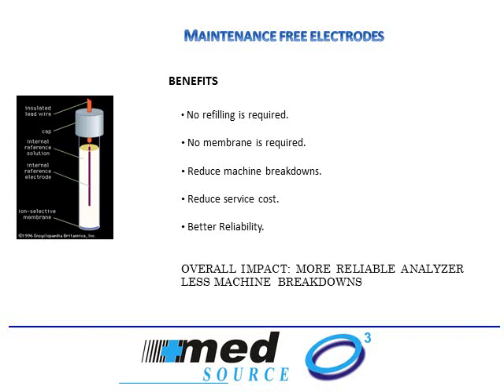The benefit of maintenance-free electrodes is that the customer is not required to maintain these electrodes by refilling them. Typically, a maintenance electrode would require an electrolyte solution which needs to be filled into the electrode every 1 month or 3 months. But in maintenance-free electrodes, no refilling is required, no membrane change is required. This means that you will install an electrode and then it will last a long amount of time, after which you will change the electrode.